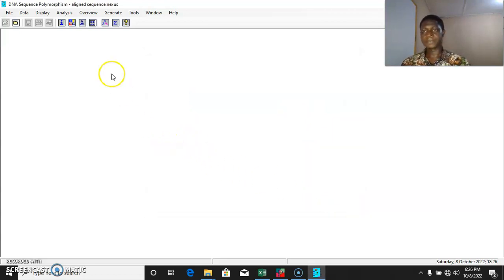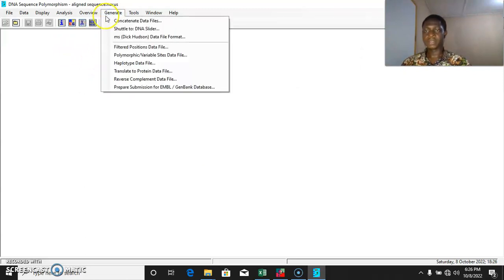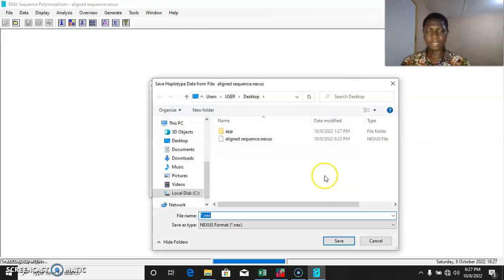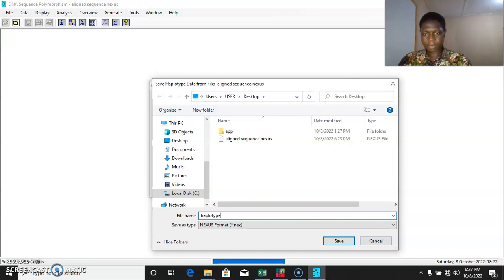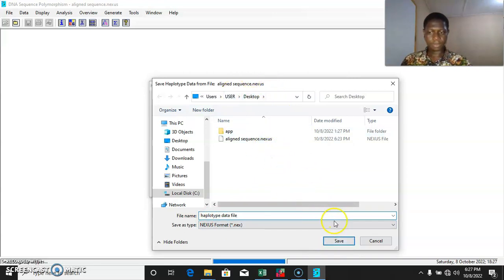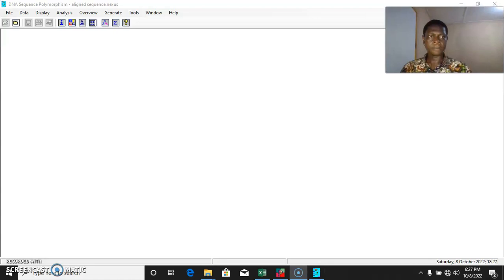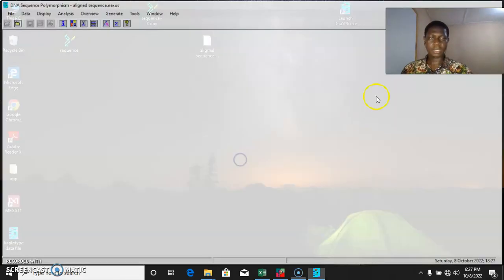The next thing we want to do is to generate the haplotype file. We come to the Generate option, select the haplotype data file. On this platform we select Included and press OK. It asks you to save the haplotype data file, so we save it as 'haplotype data file' on the desktop. Select Save. Once done, we can close the DnaSP software.